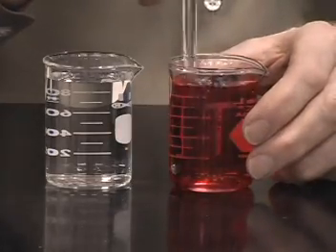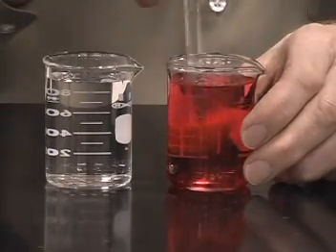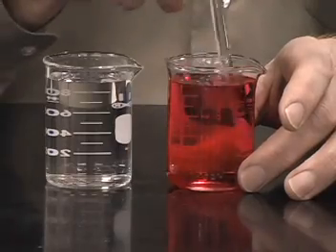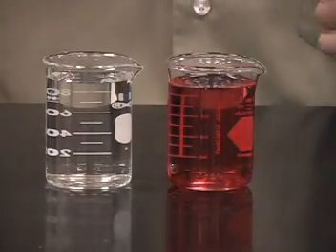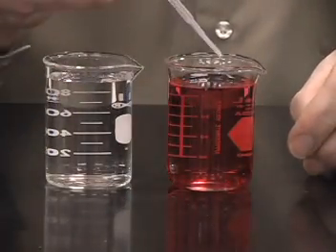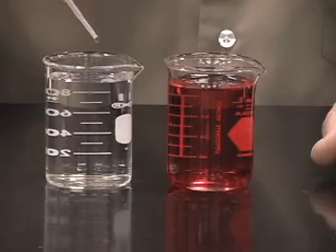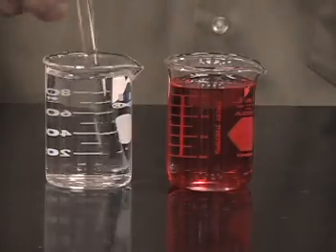And since 100 mils of water is roughly 100 grams, we have then 1 part per 1,000 in terms of the food coloring. So this is 1 part in 1,000, or we can call it 1 part per 1,000 of my pollutant. I'll now take a dropper and take 2 drops of this solution and put that into the next container. So 1, 2. So now I've got 2 drops in this container.